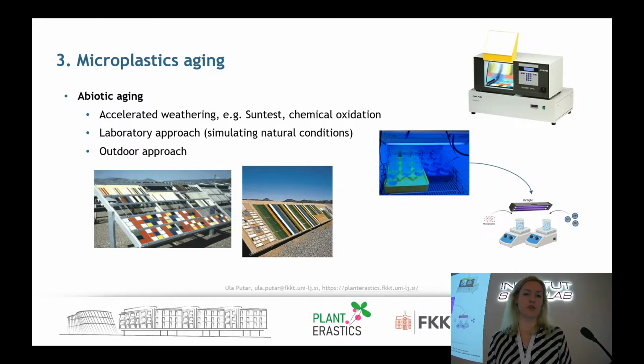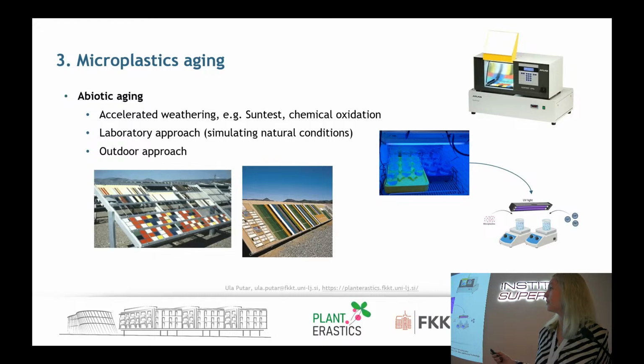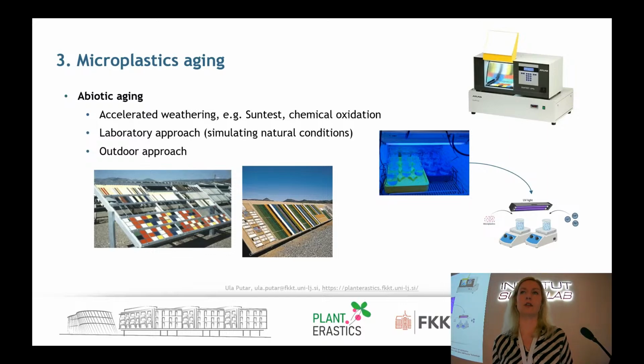The other possibility is, of course, a laboratory approach, so that you are actually simulating natural conditions. This is what we did in one of our previous studies. For example, we did abiotic aging in a medium that is very similar to fresh waters with UV lights, but the intensity was similar to the usual UV light in summer in Central Europe. So we didn't do accelerated aging, but just normal UV light intensities.